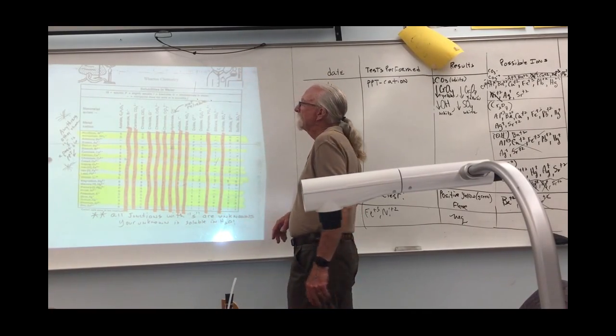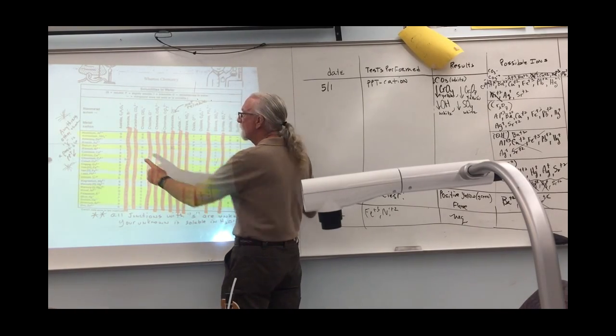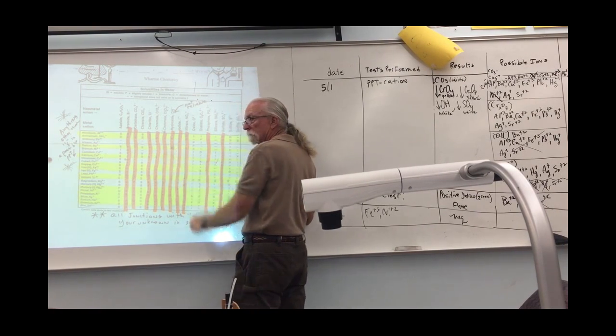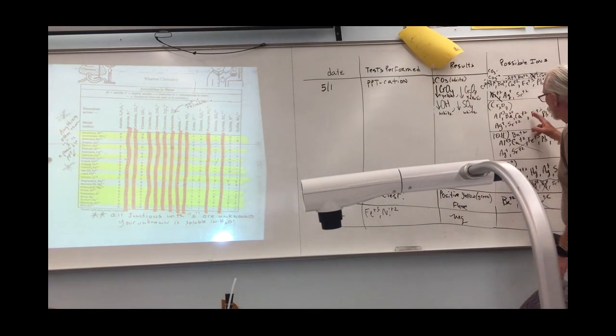All right. So, I do know this. We're back. I do know this. Barium is insoluble in our hydroxide. So I would put an I there for sure. So I make a list for that. I make a list for sulfate. There's sulfate.